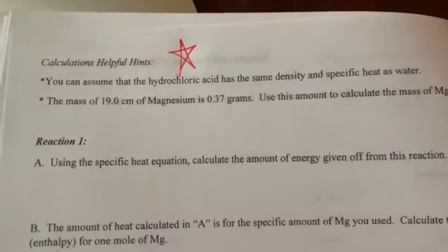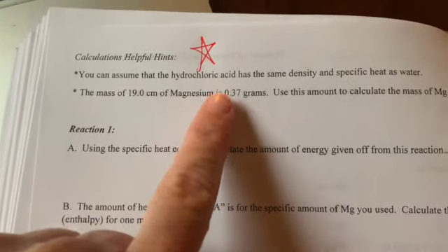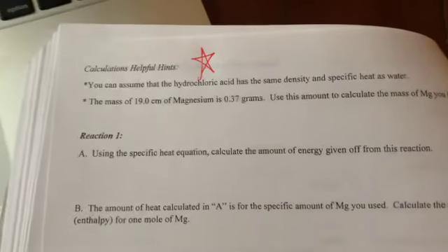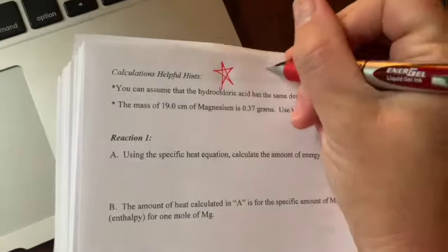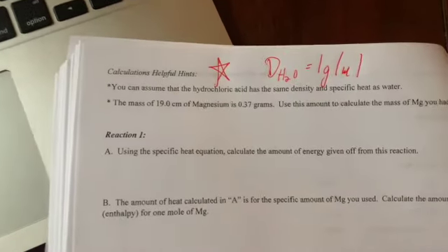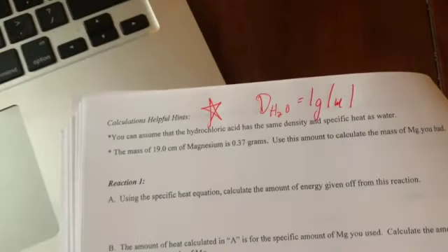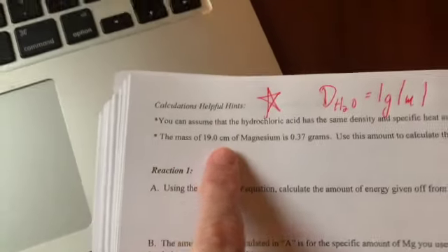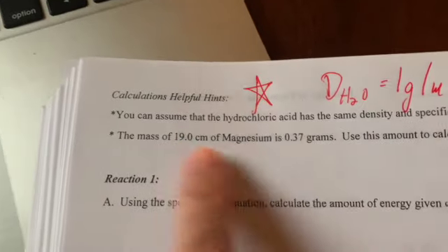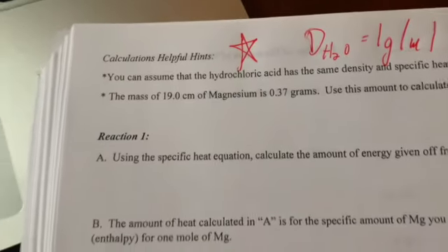All right, because you're going to use a specific heat equation. And what you can do is you can assume that the hydrochloric acid that we were measuring the temperature of has the same density and specific heat as water. So please remember the density of water is 1 gram per milliliter. And then the specific heat you should know from this unit. Also, Maurice measured the length of the magnesium. You need to be able to convert from that length to a mass. Here is your conversion for that, and you will need that in this problem.